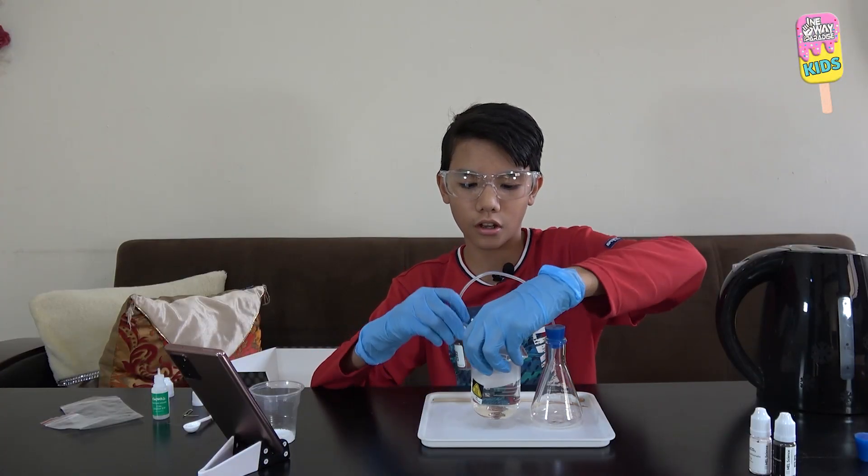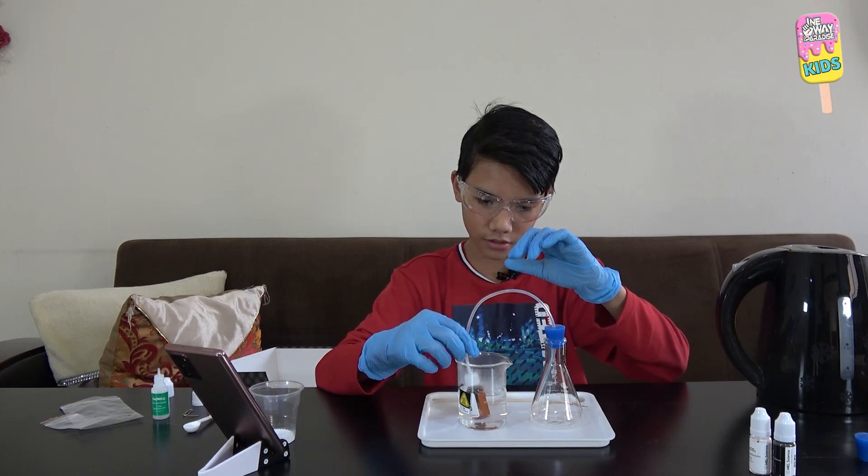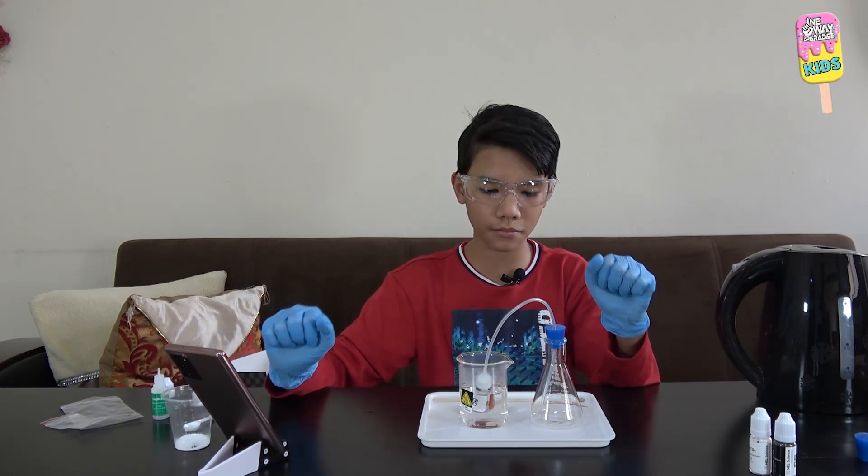And now I will put the bottle in the hot water, just like this. And now we will let it sit for 10 minutes.